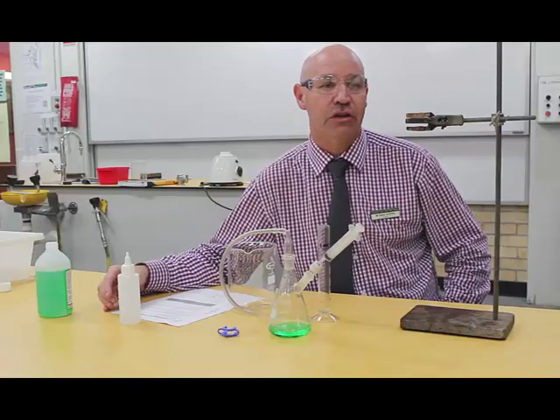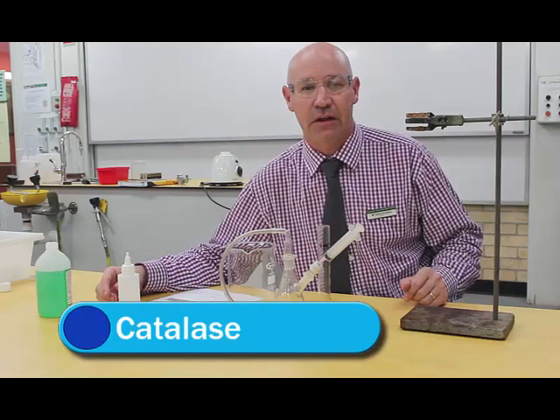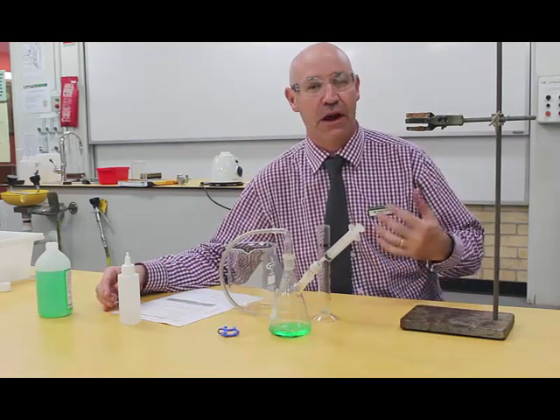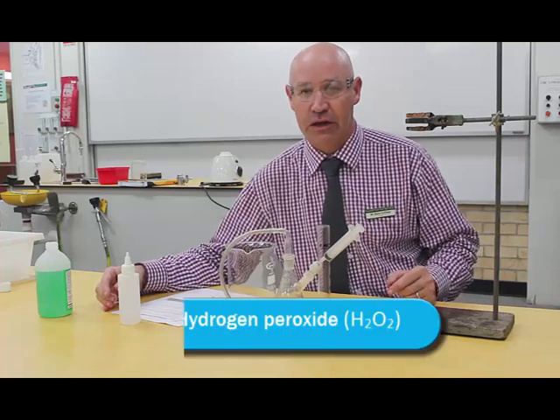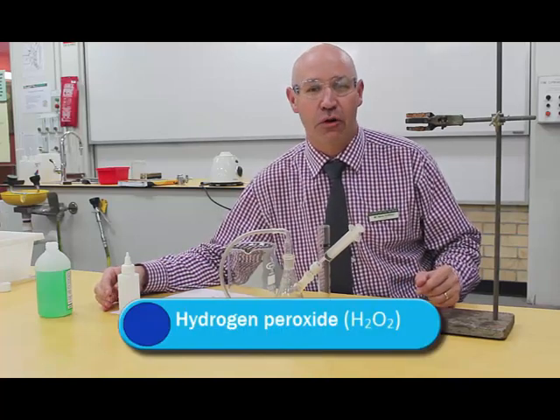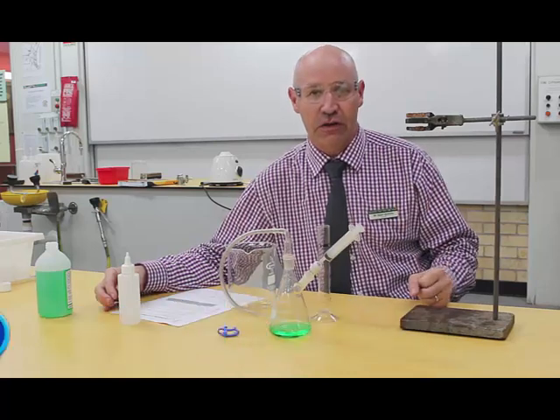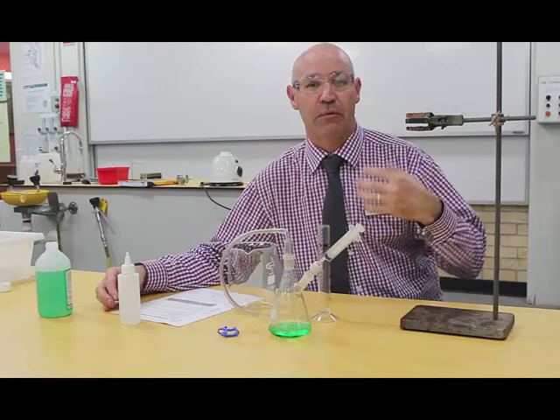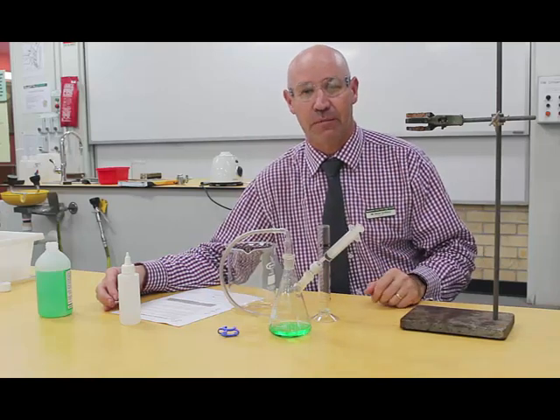This is an investigation about the enzyme catalase. Catalase is an enzyme found in many tissues, and its job is to break down hydrogen peroxide into water. Hydrogen peroxide is toxic to cells, so catalase removes the hydrogen peroxide by breaking it down to harmless water.